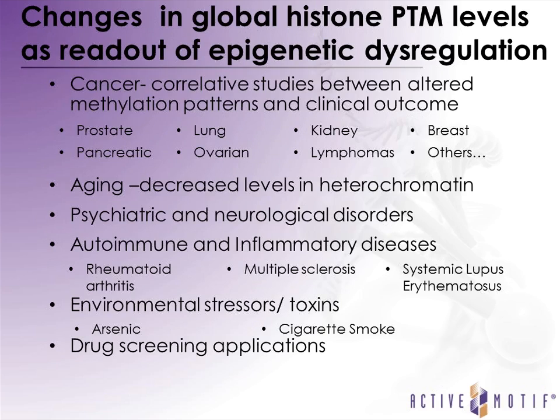Now, the dysregulation of these marks also means that the global histone levels make for attractive readouts for drug screening applications, as pharmaceutical strategies are developed to target these proteins that are dysregulated in this particular epigenetic mechanism.